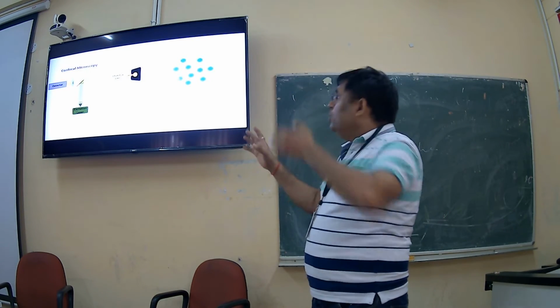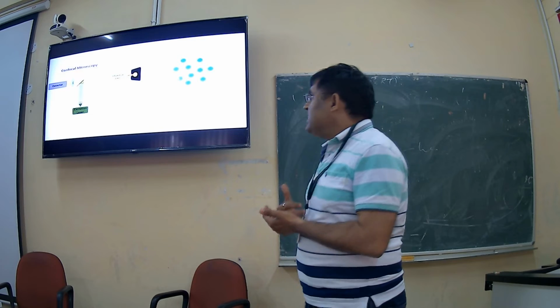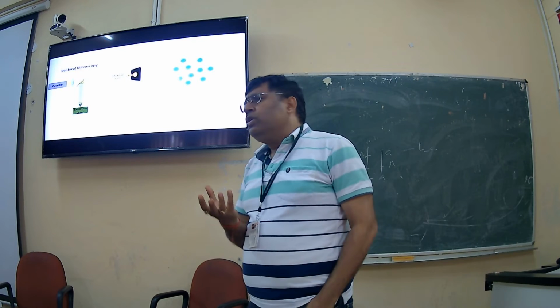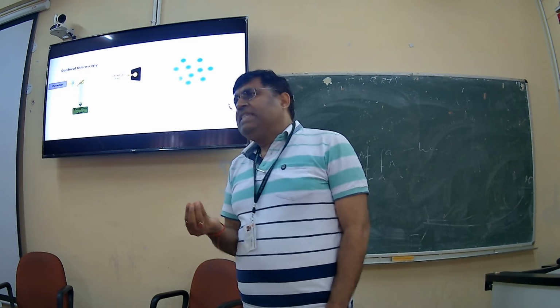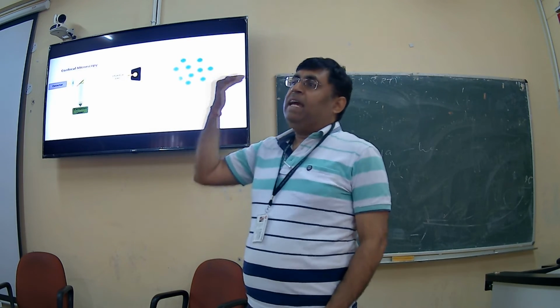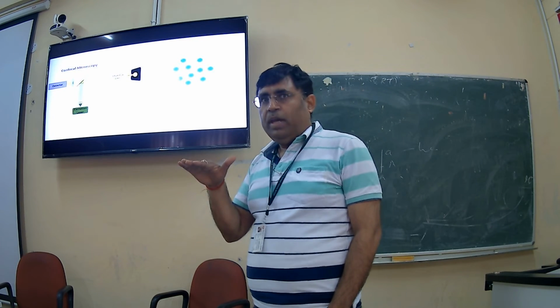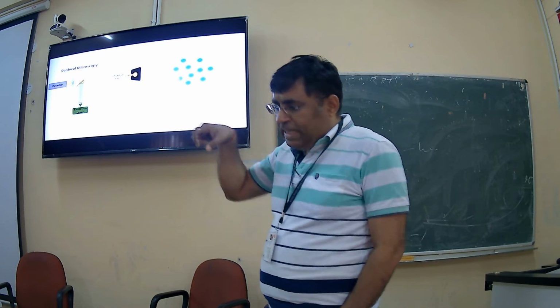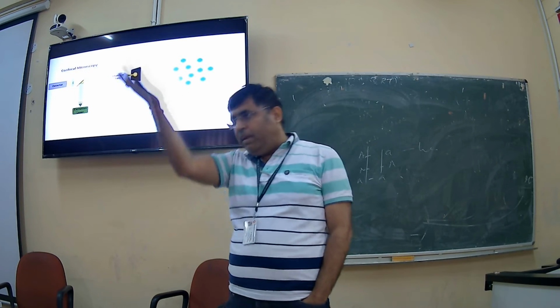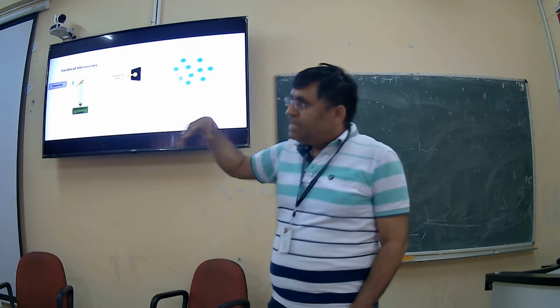Now I told you about the confocal microscope. So how does the confocal microscope work? It works on the fluorescent phenomenon where you need to excite something. Don't forget, since we have come this far, what you studied earlier about excitation and emission in fluorescence, do not forget it, remember it too. In fluorescence, light is passed and it excites the electron, which goes to the upper energy level and then comes down and emits some energy, and that's why there is fluorescence. Exactly the same thing happens in the confocal.